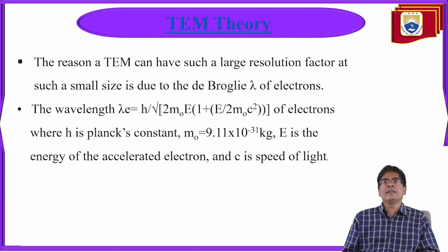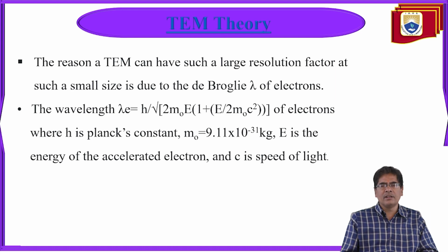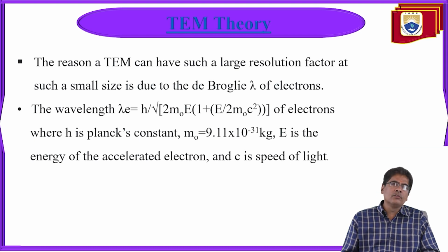The reason a TEM can have such a large resolution factor at such a small size is due to the de Broglie wavelength of electrons. That is what we studied when we learned about the dual nature of matter and radiation.